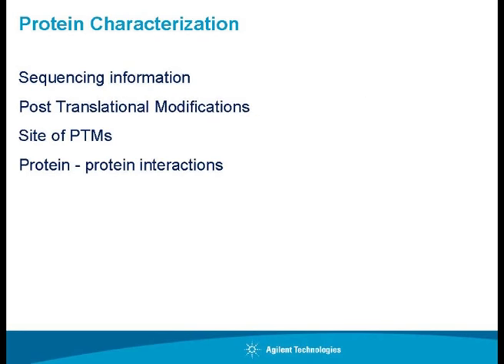The second is characterization: you sequence it, and you identify or characterize what the modifications are. The protein can be in native form, it can be in modified forms, and what are the sites where it is modified. That is the characterization, and then interactions, and then quantification, either absolute using iTRAQ sort of technology, or label free, differential.